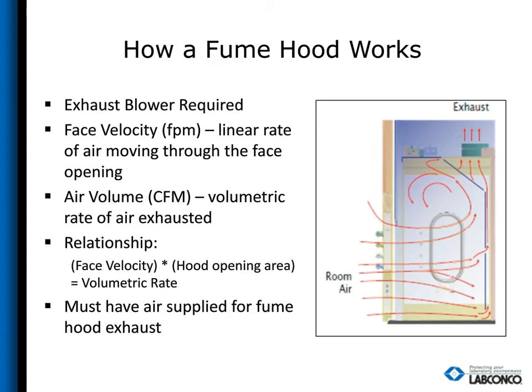So the other measurement we look at is the speed of the air going through the front of the fume hood, and we call that the face velocity. Depending on how much air you're putting through that front opening, that will determine face velocity.